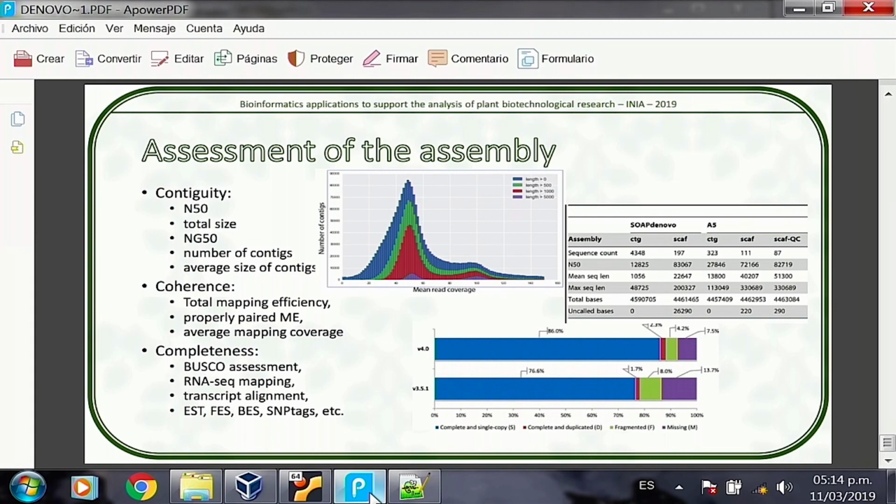All right, so we're going to leave it there for now. If you have any further questions, please don't hesitate to contact any of us. I know there's a part missing, the genome assembly, but we don't have the time to go through that at this point, unfortunately. It's going to take way too long to actually do a genome assembly. That's fine. I'll just let David take over after this. If you have any questions, please don't hesitate to ask.